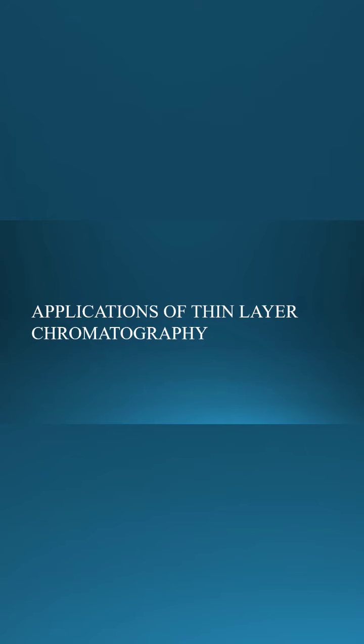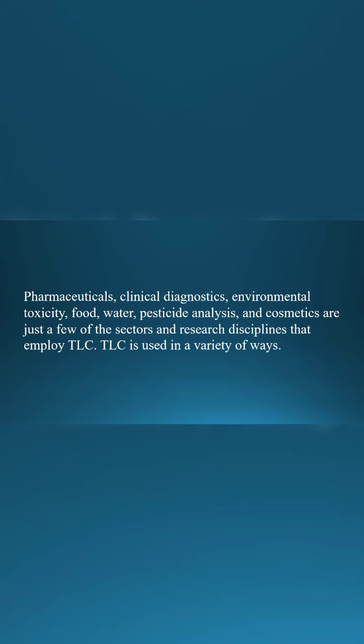Applications of thin layer chromatography. Pharmaceuticals, clinical diagnostics, environmental toxicity, food, water, pesticide analysis, and cosmetics are just a few sectors and research disciplines that employ TLC. TLC is used in a variety of ways.